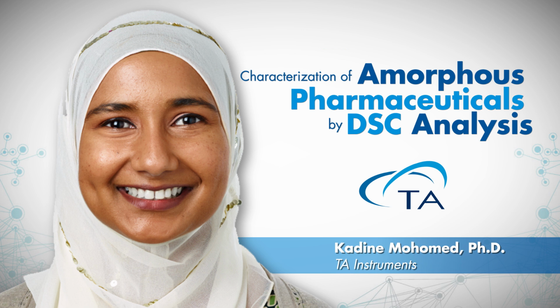If your sample is going to react with your pan material, let's say your sample is going to react with aluminum or gold or stainless steel, is alumina, the ceramic pan, an option? Absolutely.